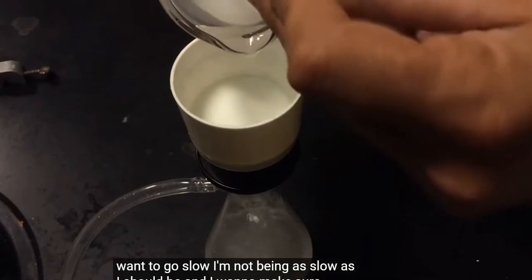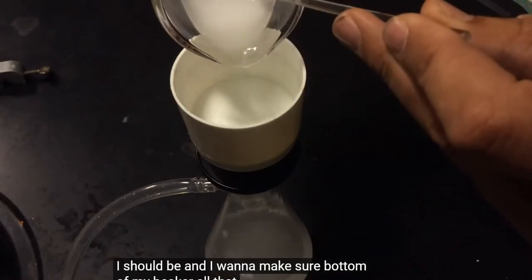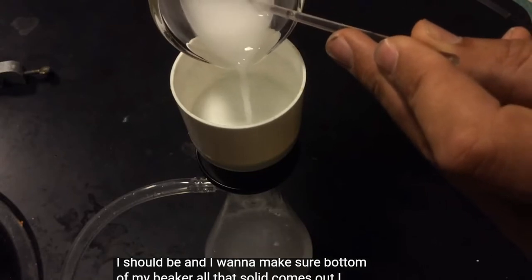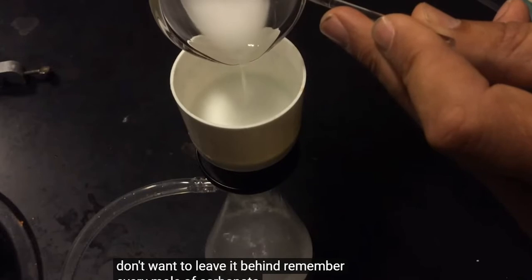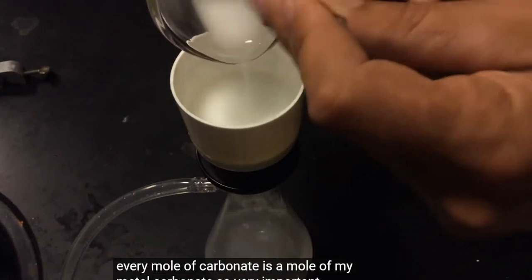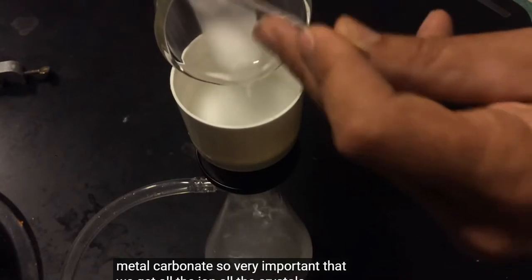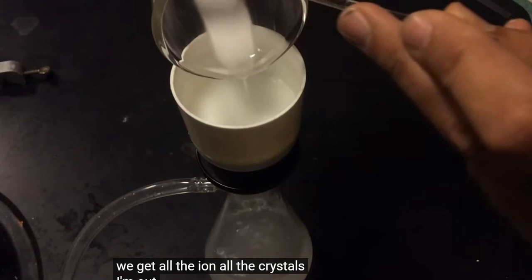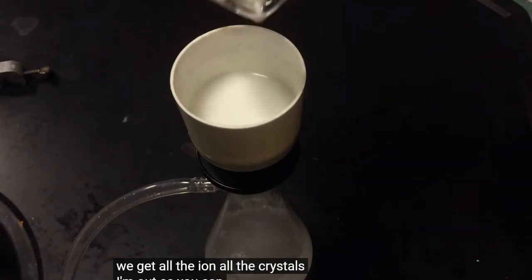I'll make sure I don't leave the bottom of my beaker, all that solid comes out. I don't want to leave it behind. Remember, every mole of carbonate is a mole of my metal carbonate, so it's very important to get all the crystals out. As you can see in my beaker, I've got some solid left behind.